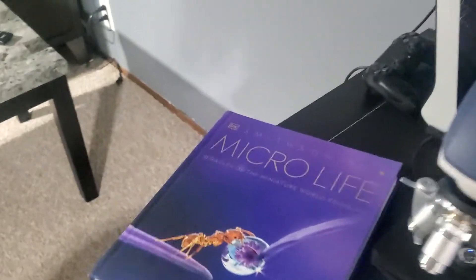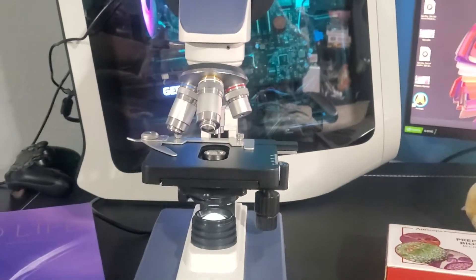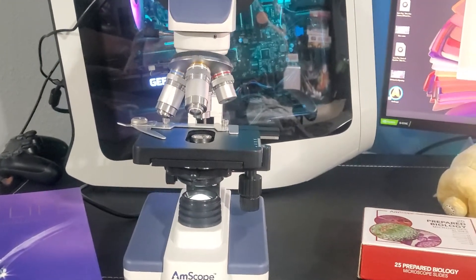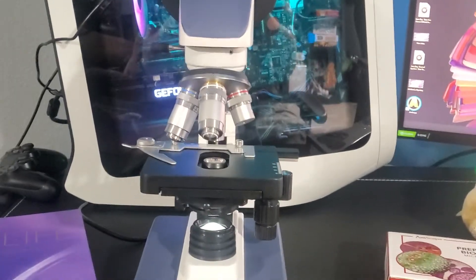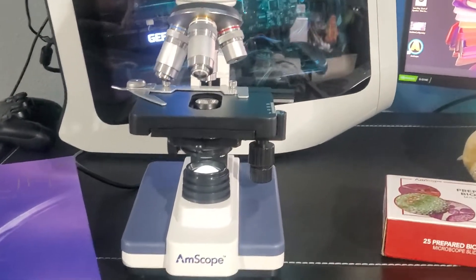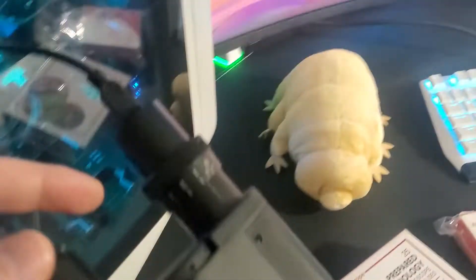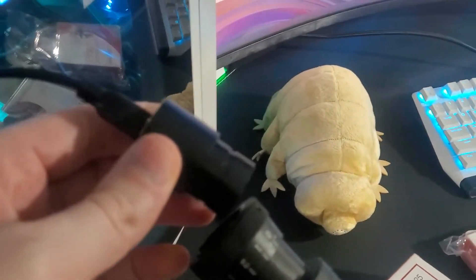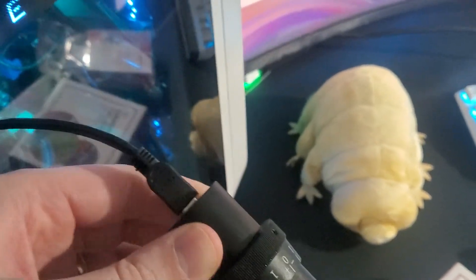What's up guys, Mr. Alan C here and we are checking out some incredible products. First we're taking a look at the AM Scope LED digital binocular compound microscope with the 3D stage plus a USB camera. How this works is we have a camera right here which goes into the eyepiece, and then you can plug this cord in and run it to your computer.